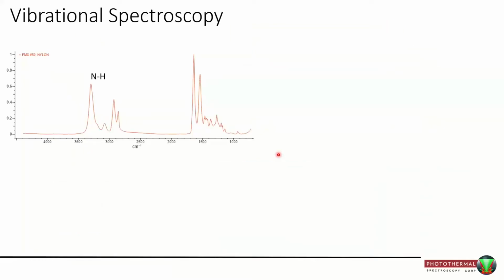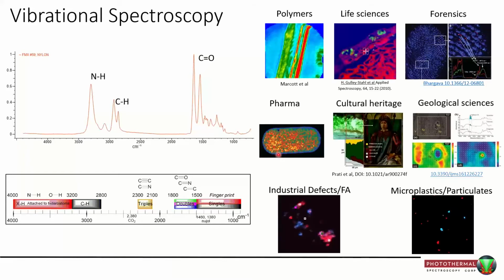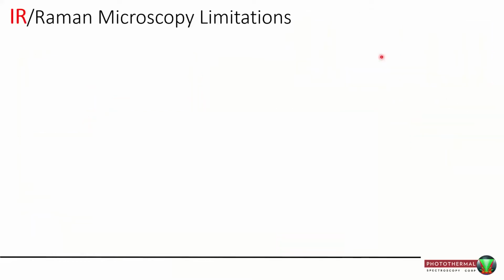So I assume most of you are familiar with vibrational spectroscopy. Suffice to say, it's all about vibrations of molecules, it's the name, and each of the peaks in a spectrum corresponds to a functional group, and it's been used for decades. It's been used across a whole wide range of applications, but today obviously we'll be focusing on life science, and that's perhaps the most exciting field and the area of vibrational spectroscopy, I think, that's growing the fastest and has the most potential as well.